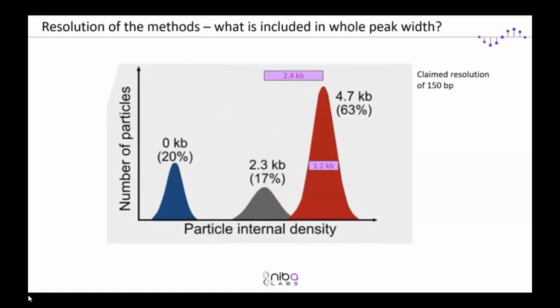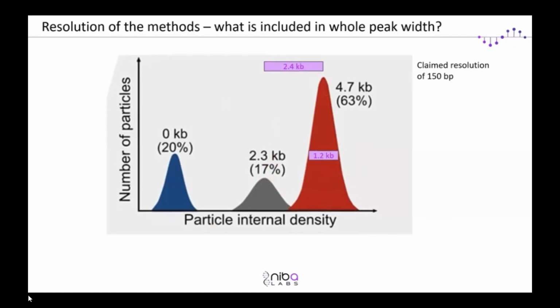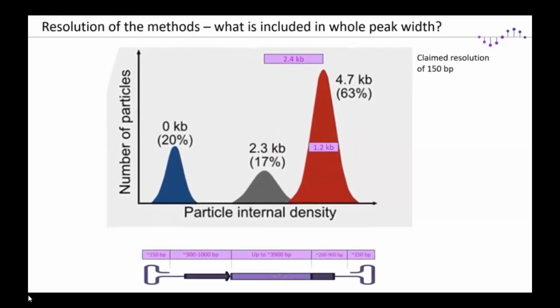Now, if we go further and move that into the AAV genome, you can see that there are some, let's say, initial construct parts that are relatively short, but when you come to the promoters or to the terminators, the polyA tails, you can have quite a variety here.